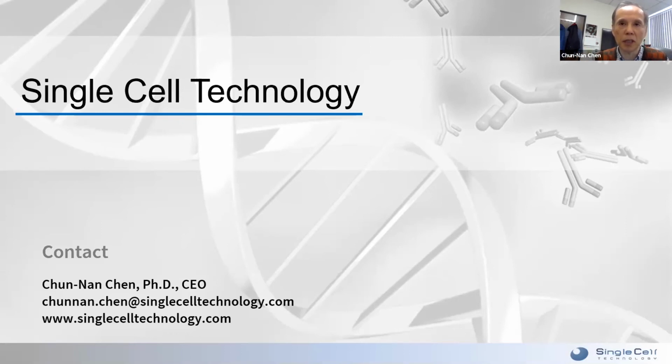The capturing time ranges from 40 minutes to 50 minutes, and sometimes maybe an hour, depending on how many of these you want to capture. And obviously the more you do, we found that they are already secreting antibodies, so the subsequent capture could be less time.